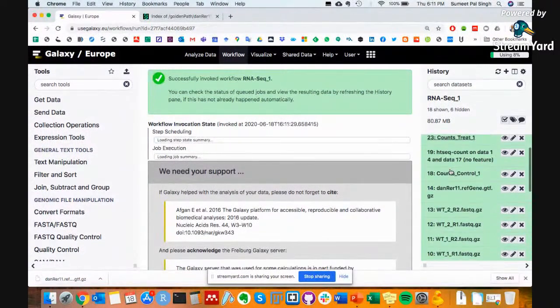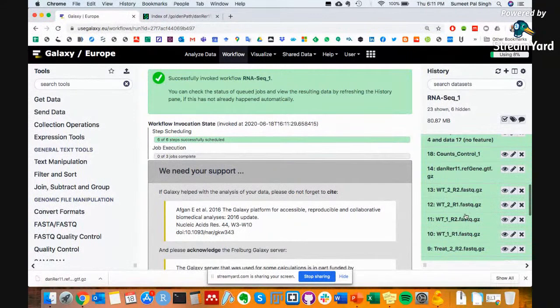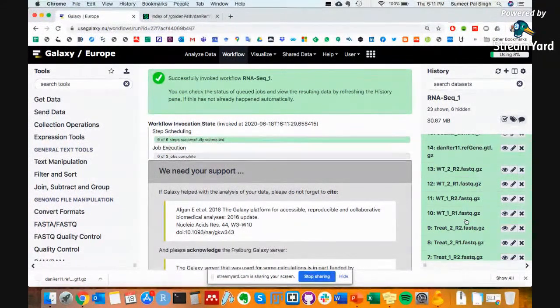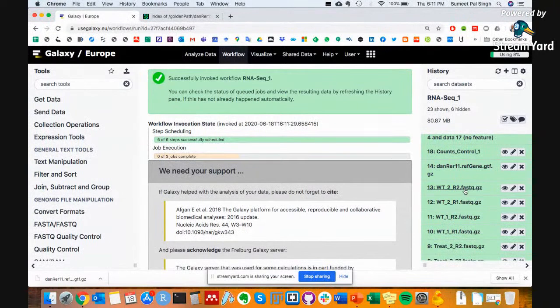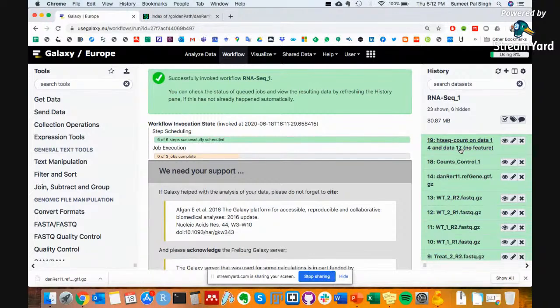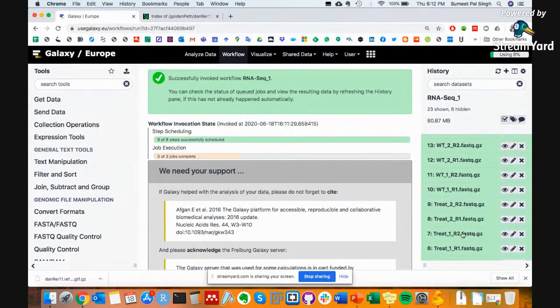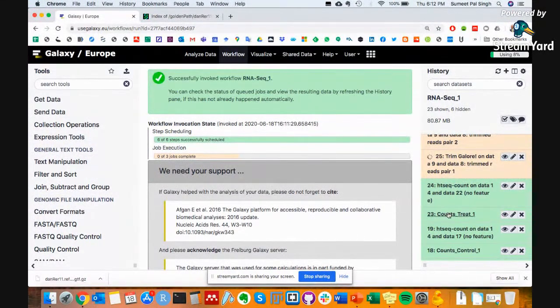Typically, what I like to do, which I did not do today, is get two files. So, I put everything on the FTP server, but only bring one PairedEnd read into Galaxy, run the full workflow, then bring the next PairedEnd, then run the full workflow. So do it one by one. That's because then you have your two reads and the results of those two reads right next to it. But here we got everything at once, so it becomes confusing. You have to always look back: okay, this result is from this data.